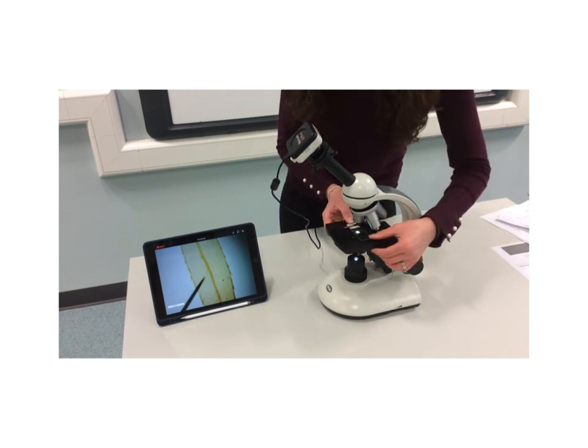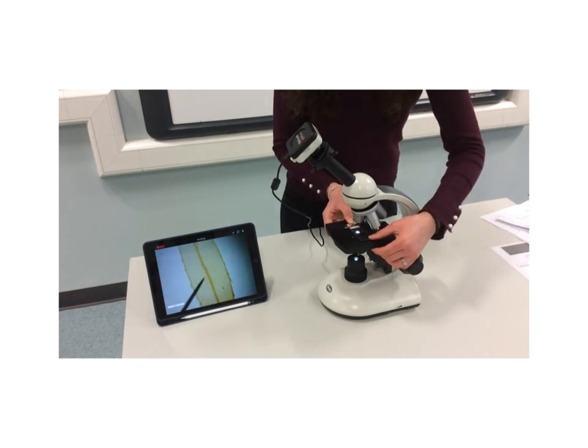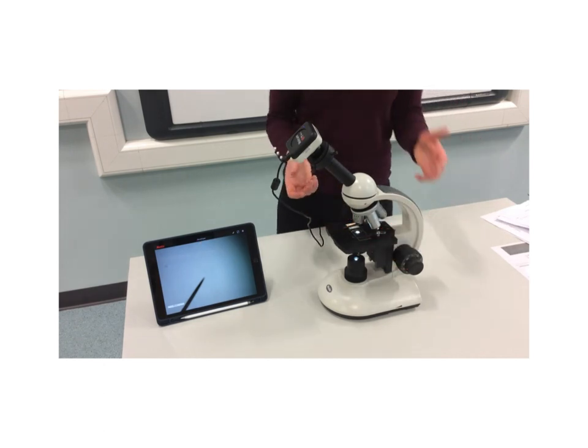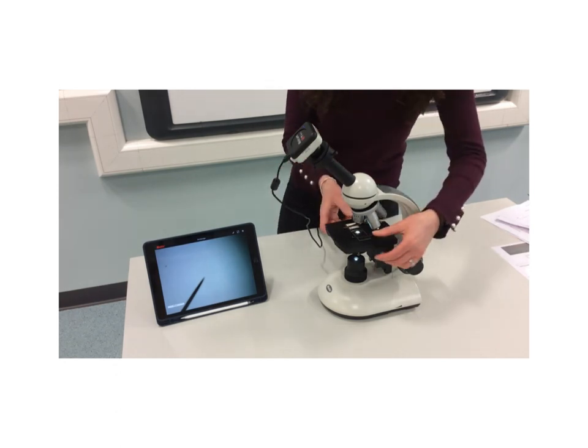From the top of your notes then, the first one says what happens when it moves to the right. So look very carefully. When we move the slide to the right, the image moves to the left. What happens when we move the slide to the left? The image is moving to the right. Let me put it back in the center again. What happens when we move the slide up? The image moves down. And what happens when we move the slide down? The image moves up. So in other words, when we move the slide, the image that we see moves in the opposite direction.